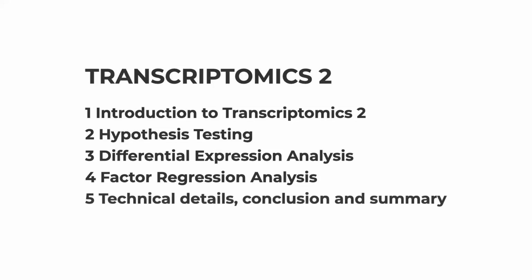And also, when we do such analysis, we need to have some considerations that are specific to the type of data that we're dealing with, or transcriptomic data, which means that we have to look at, for example, multiple testing, which affects our statistical analysis, but also we have to look at the relationship between what's in the data, the statistical test, and its biological significance. So we'll try to tie in some of these things together in the first portion of today's session.